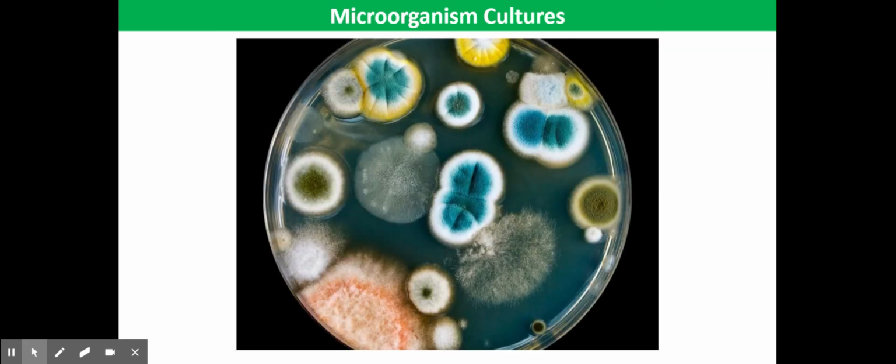In contrast, filamentous fungi grow into a mass of hyphae, which may also be circular, but the mass is not shiny and often looks a little bit like cotton wool, with furry aerial hyphae. Single-celled fungi, like yeast, grow as circular colonies.